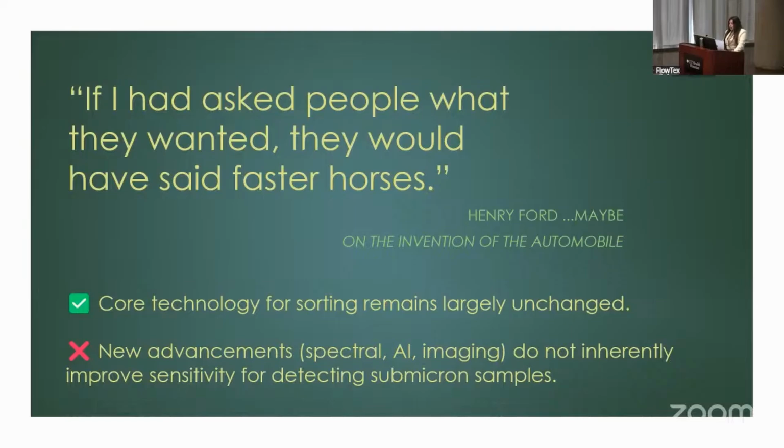And yes, but I genuinely believe that both the sorting and the validation are much more qualitative in nature. And I think that's okay, right? I think imaging technologies and cultivations are key techniques for the validation. So I'm going to start out with 3 case studies of microscopy-validated examples. And then I'm going to move on to the operational context of the SRL and the considerations and challenges doing these sorts in a general SRL setting alongside more traditional experimentation.